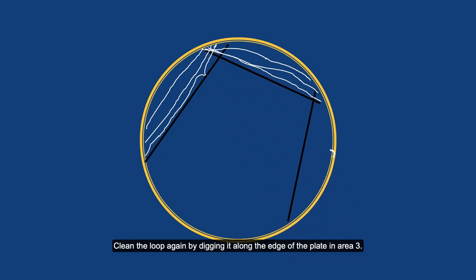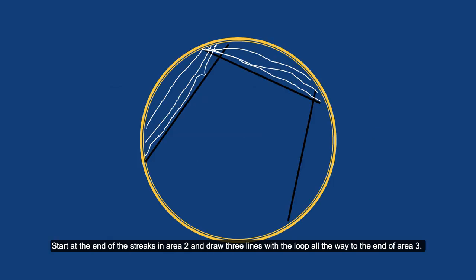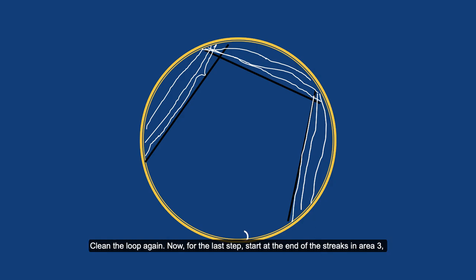Clean the loop again by digging it along the edge of the plate in area three. Turn the plate around so you can get easy access to area three. Start at the end of the streaks in area two and draw three lines with the loop all the way to the end of area three. Clean the loop again.